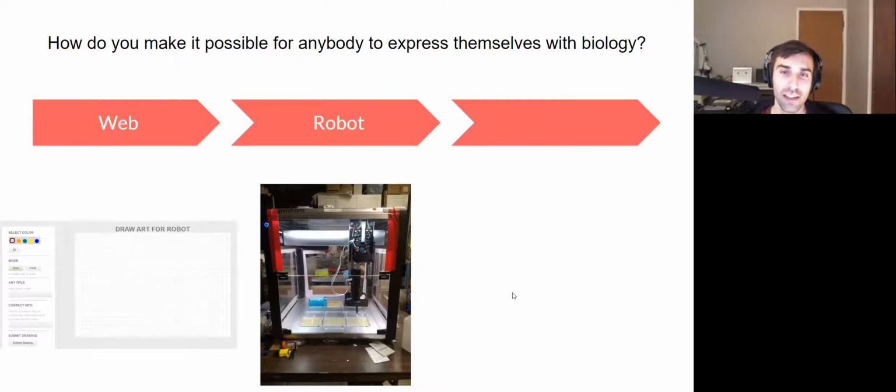So we see that this works pretty well. How can we translate this to what we've been doing? Well, hopefully this connection starts to make sense. I've been calling it this walled garden learning model. It's this idea that BioArtBot is this fun little controlled space where you make a drawing and it's nice. And we make that first quote unquote experiment really straightforward. Think of a drawing you want to draw and then draw it and see if it can grow in this really standardized way. So that's nice, but it's a pretty limited process overall.